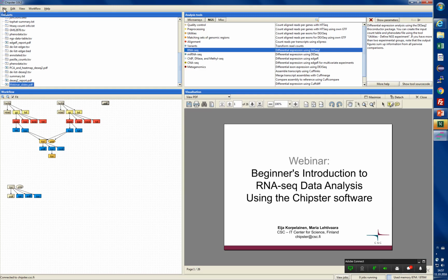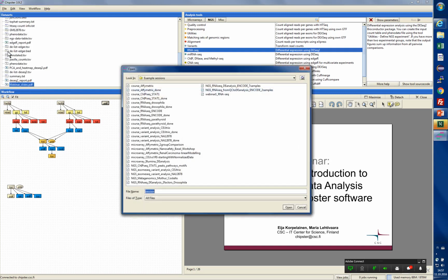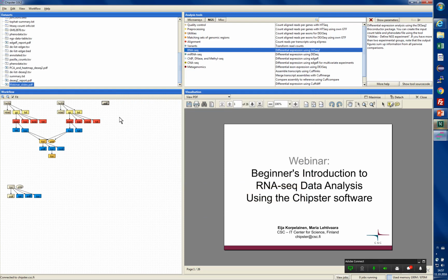Can you maybe show how you open an example session? So you go to File, Open Example Session, and then there should be quite a bunch of different example sessions, and this is the webinar one. There you can open this exact session, and indeed you have the PDF with these slides there. Also, in the original event page, I have listed some course materials, so there you can see a bunch of those. Okay. There are also other questions regarding exome-seq data.